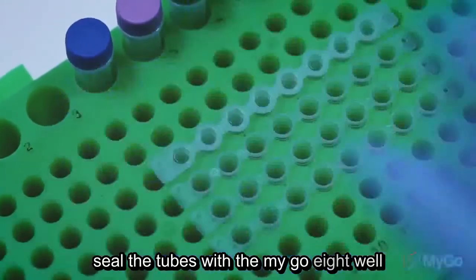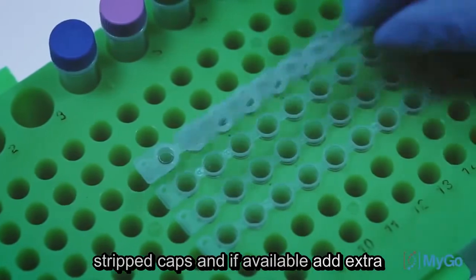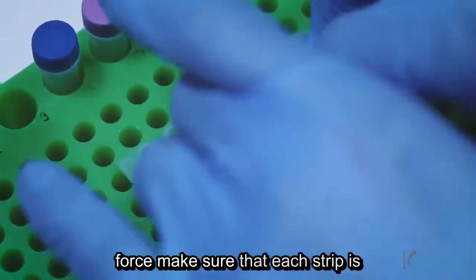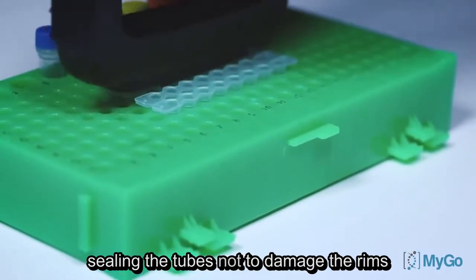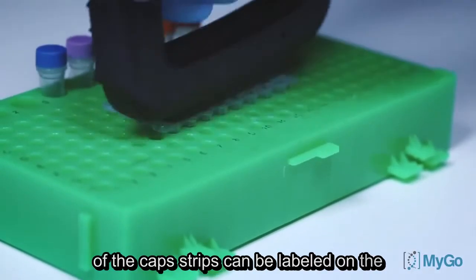Seal the tubes with the MYGO 8-well strip caps, and if available, add extra force. Make sure that each strip is sealed securely, and take care when sealing the tubes, not to damage the rims of the caps.